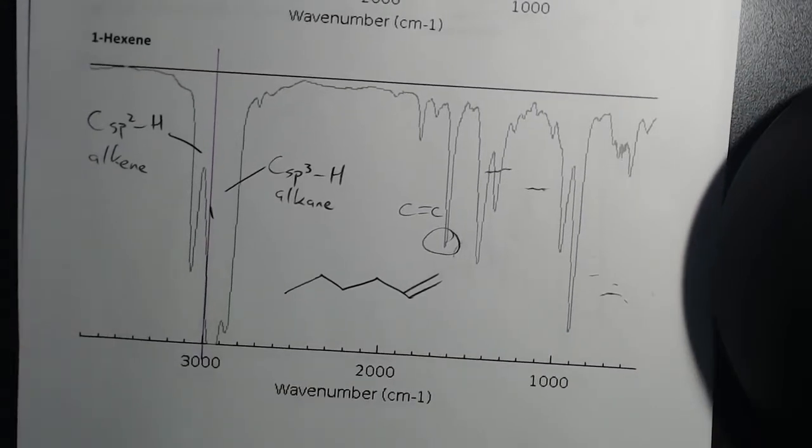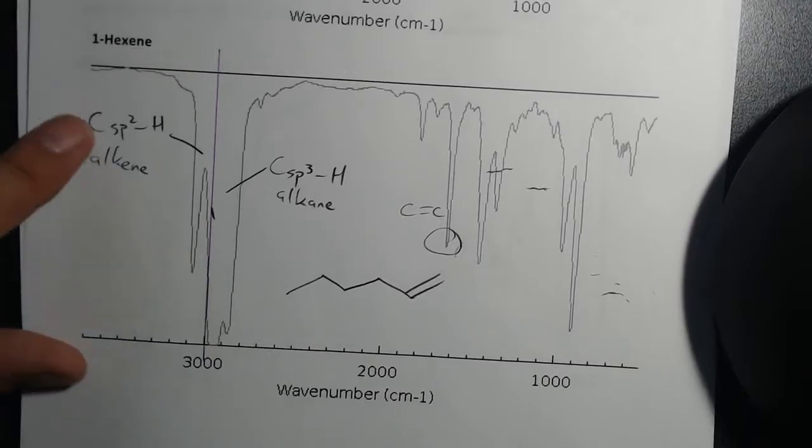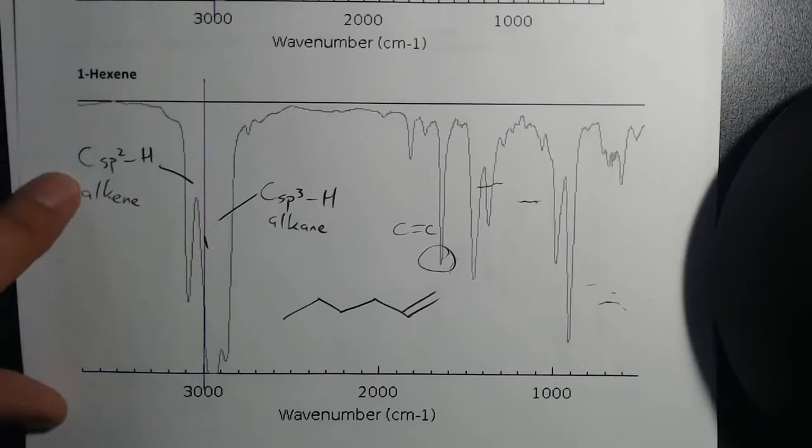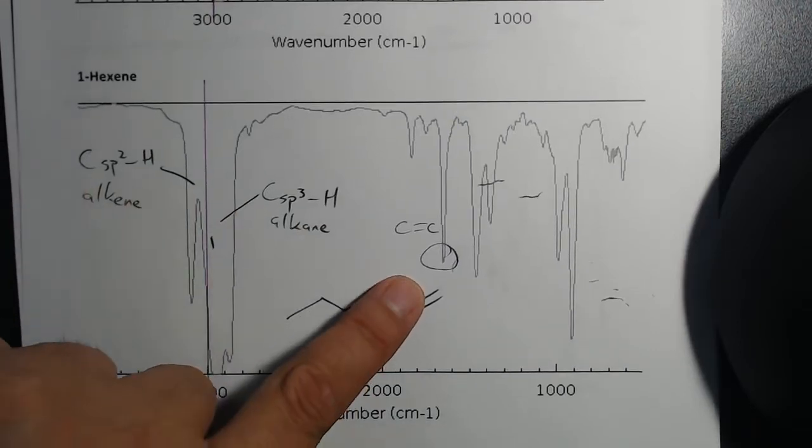If you have this here, and you think, okay, that looks like it might be a C-sp2-H stretch from an alkene, you can confirm the alkene by looking for the C=C. It has to have both, or does it? If you have this one, you typically have this one.